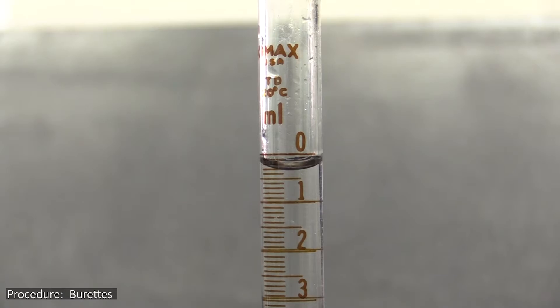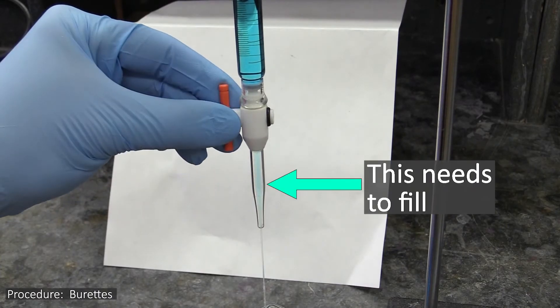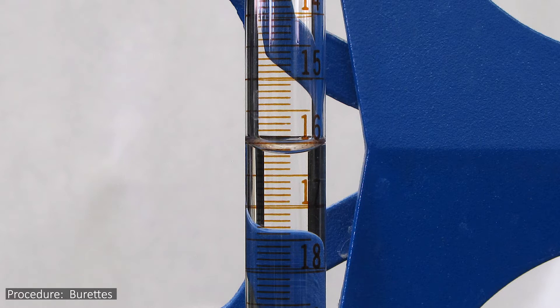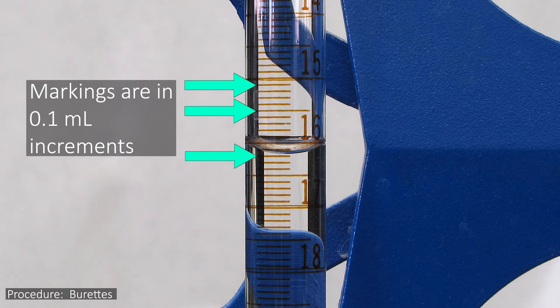There are two reasons for doing this. One is it gets all the air out of the spout at the bottom. The other reason has to do with how the burettes are read. Since the actual physical markings on a burette are in tenths of a mL, you have to interpolate between them to read in hundredths of a mL.